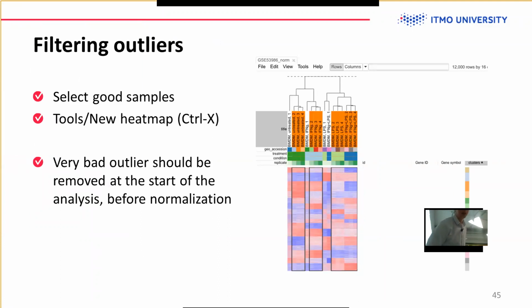And the thing is that now we can tell. We saw multiple times already that our first samples are outliers, and in this case it's pretty simple. We can see that it corresponds to something in the dataset metadata, like the number of samples.